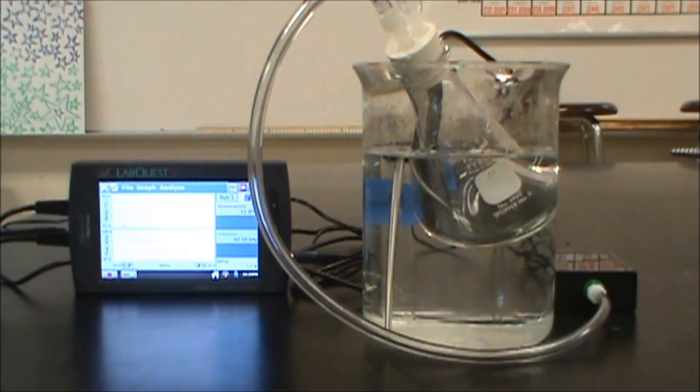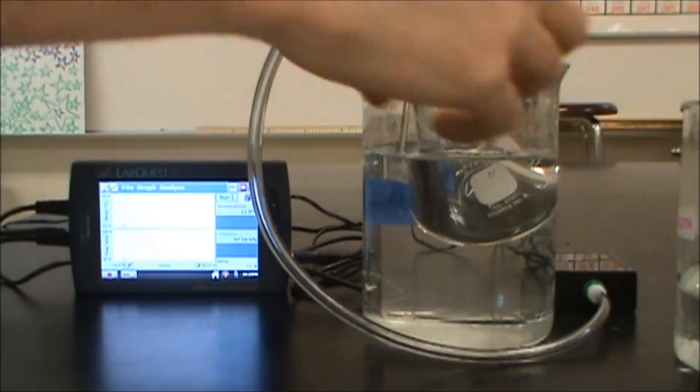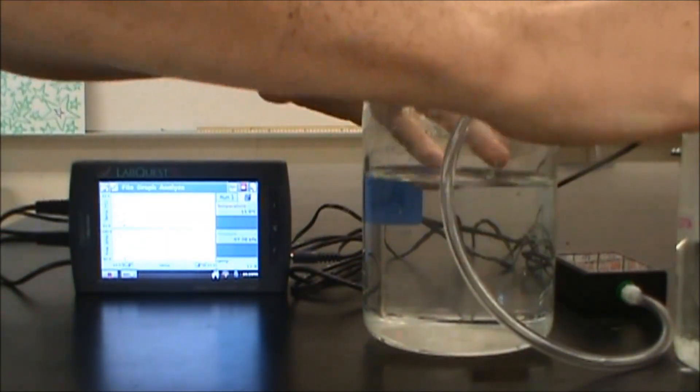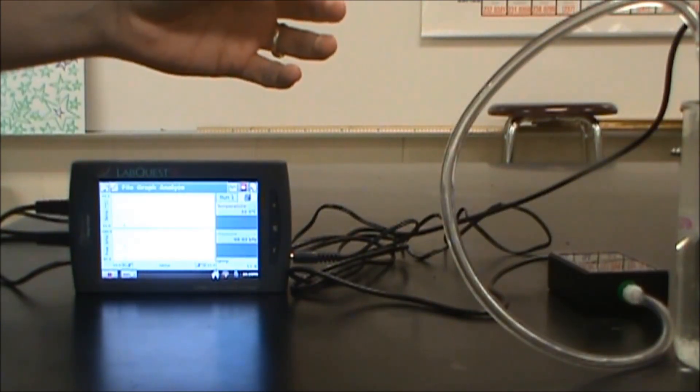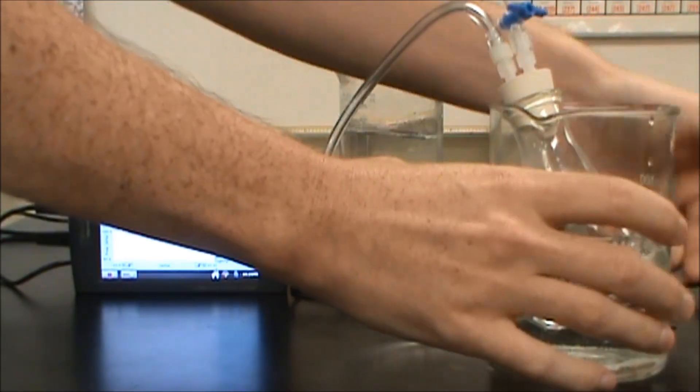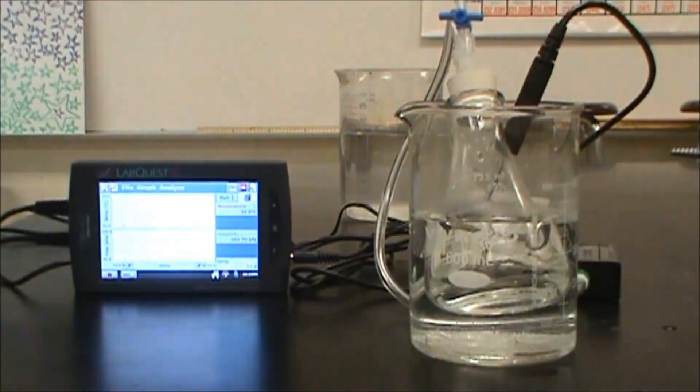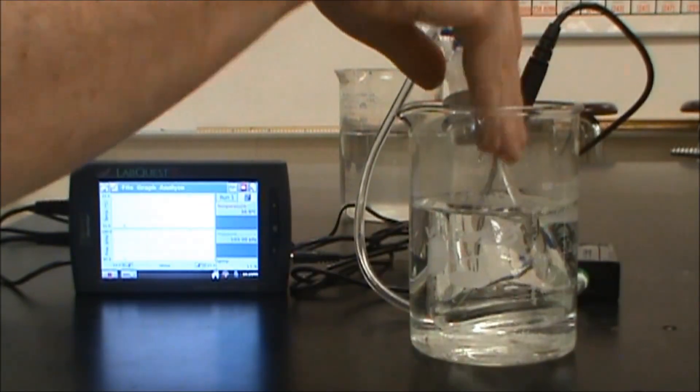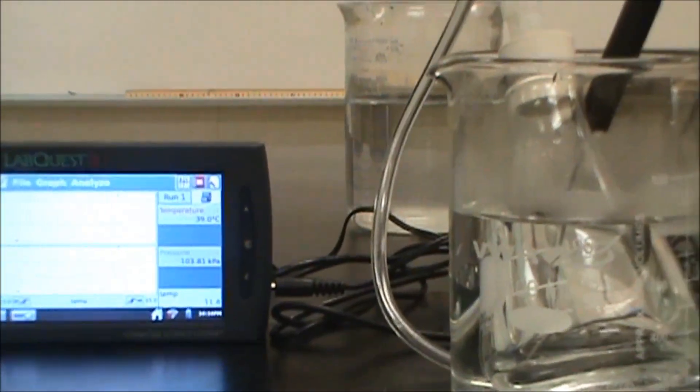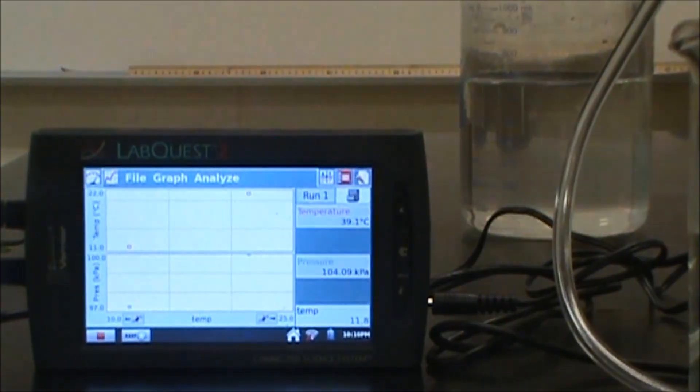Now I'm going to do the opposite end of the spectrum. I'm going to bring over some warm water. I'm going to take this out of here and pour a little bit of the cold water in with the warm water. Then I'm going to later put it into hot water and I'm going to try and get five different data points. Again, currently that is cold. I want that to sit for long enough until it gets to the point where I'm confident that the temperature has equilibrated.